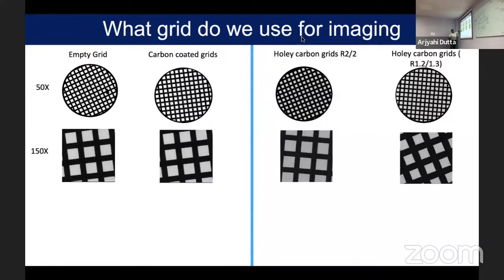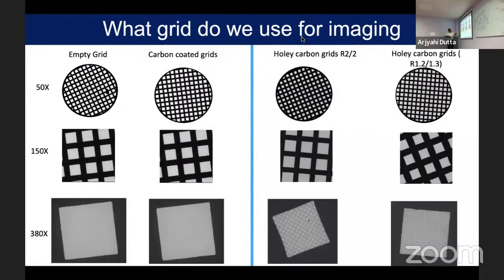And then on top there is an amorphous carbon layer, because you need some platform where you can add the sample. If you look at this particular square, you can see there is a platform where you can add the sample, and then you can image it. You cannot use a non-transparent thing. You need that amorphous carbon layer so your beam can transmit through it. If it is not transparent, it is going to block your sample. Generally, the thickness will be only 15 to 20 nanometers, not more than that.